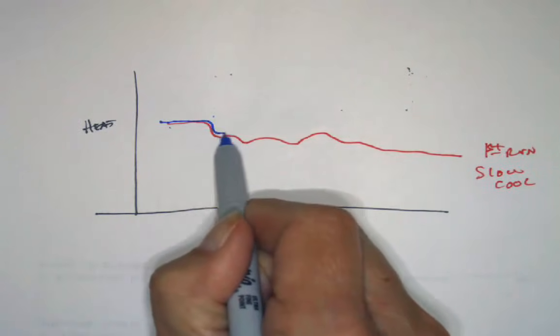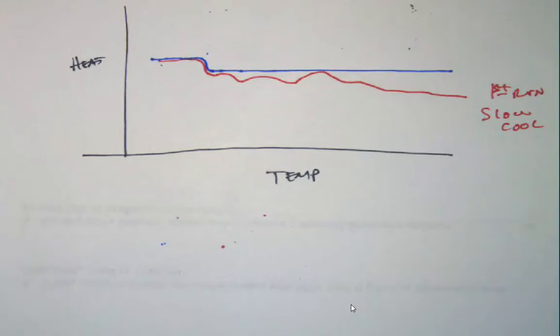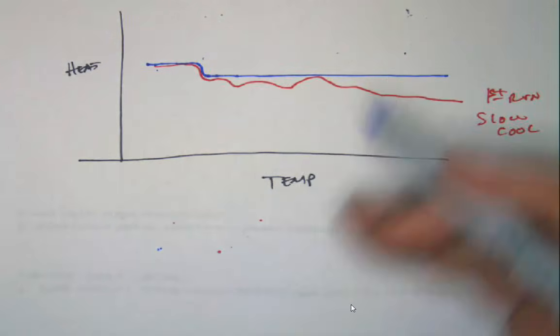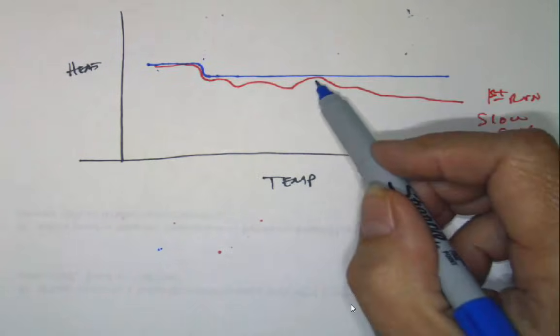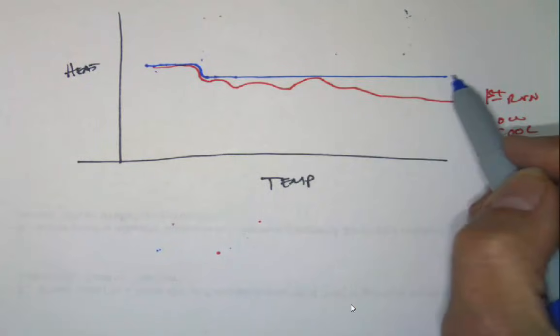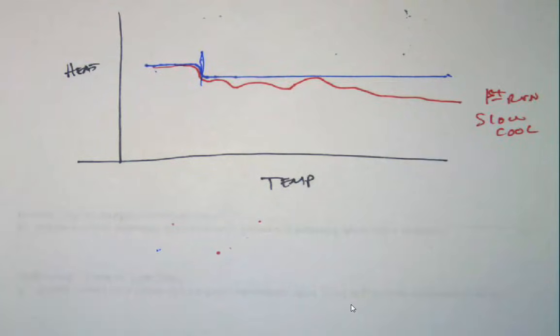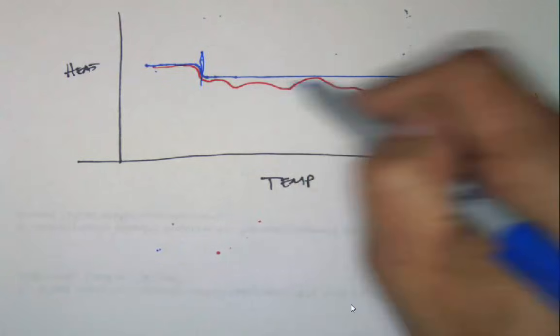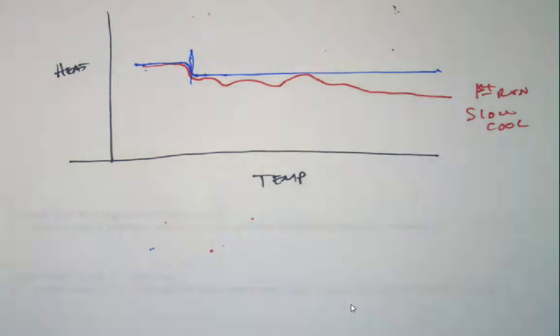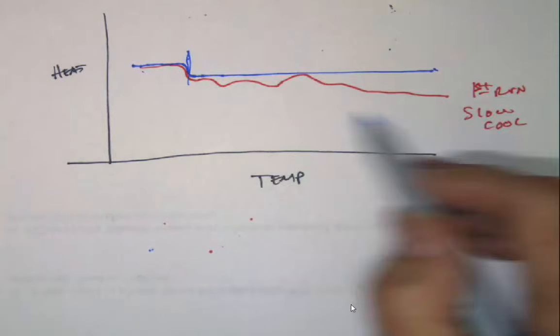And on our second run, we end up with this beautiful baseline. Nothing's happening. Okay. And so you say, well, this is an amorphous material. I got a Tg. I don't see melting. I don't see crystallization. I don't know if this is a thermoset or thermoplastic from the graph, right? All we know is I got a Tg. So I have predominantly amorphous behavior. The Tg size didn't change from the first run to the second run, so we didn't alter the amount of amorphous material or anything. But we have this weird baseline that's misbehaving.